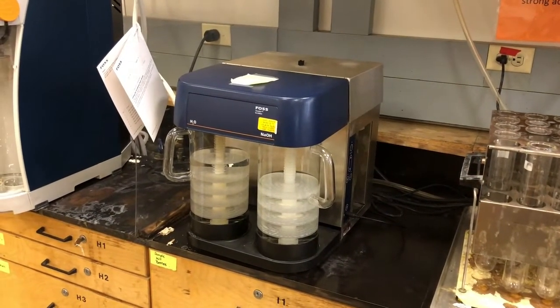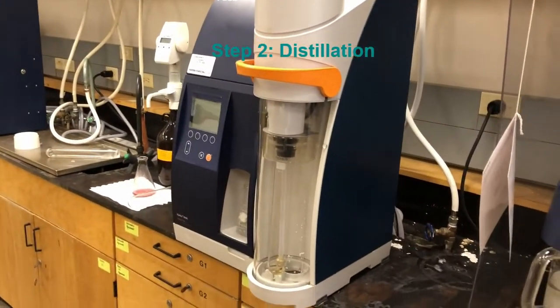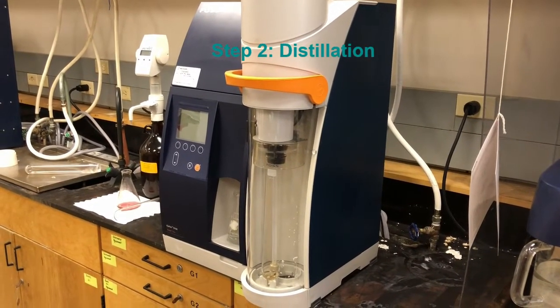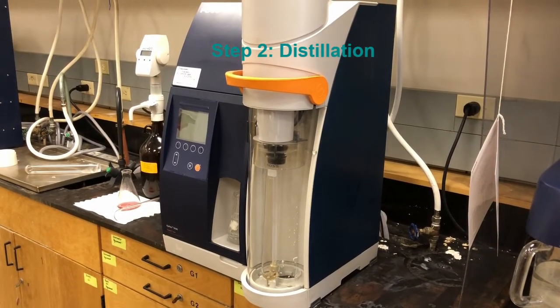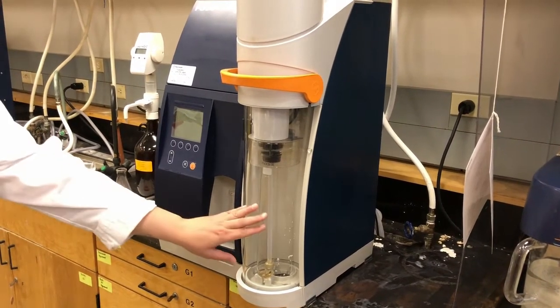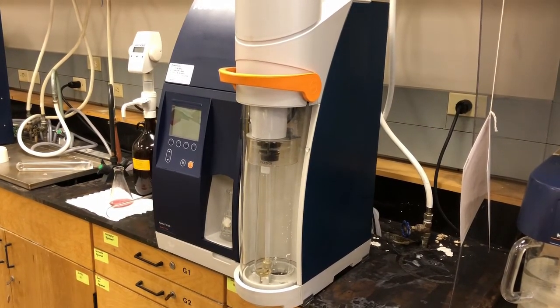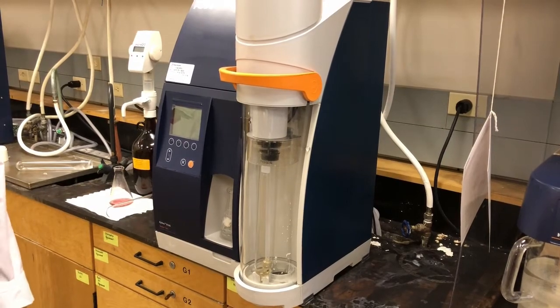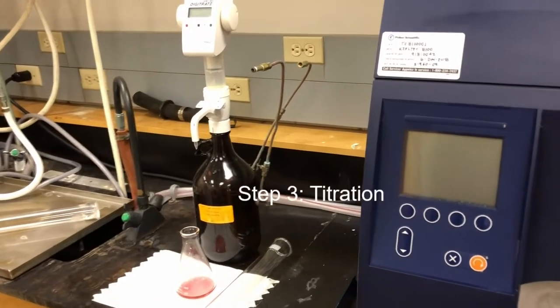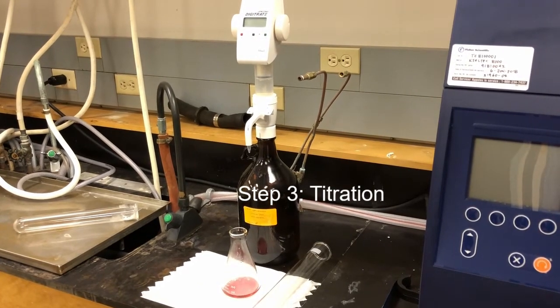Once the digestion is done, we move over and do a distillation. We have another piece of equipment for that. In the distillation, we add a strong base, sodium hydroxide in this case, and it is a steam distillation that distills the ammonia from the sample into boric acid. We put our sample in here. Inside this, the pieces you can't see, is a heating coil and a condenser, so the ammonia comes out into our receiving flask. And then the third and final step is a titration, and we're going to use a digital titrator with hydrochloric acid to determine how much ammonia is in the sample.